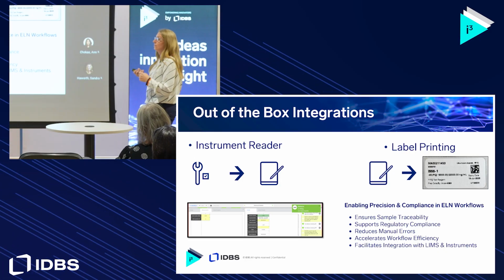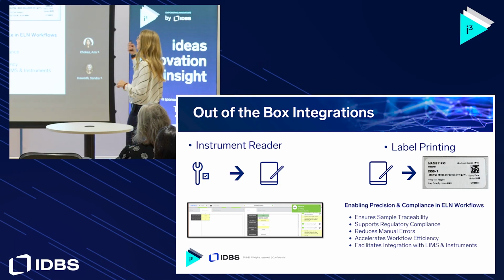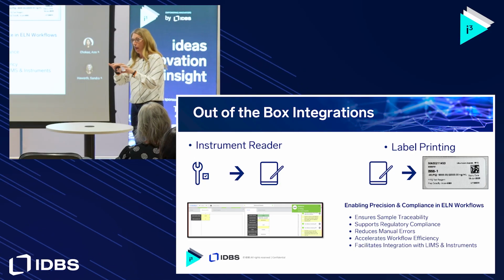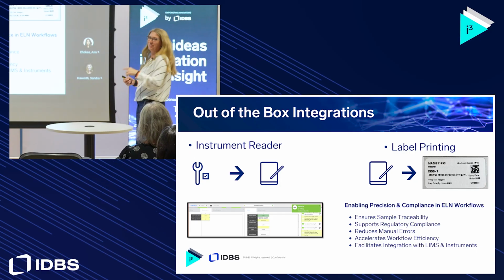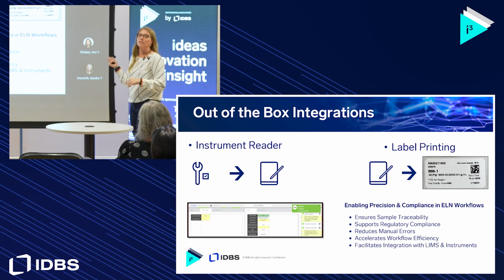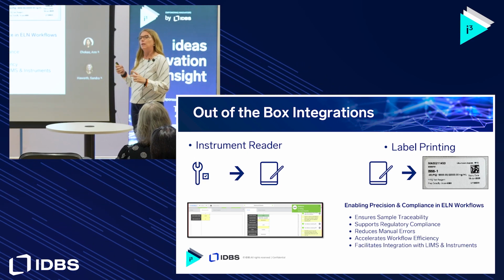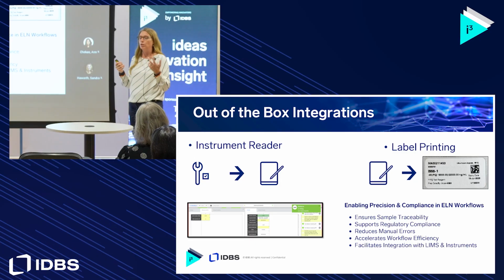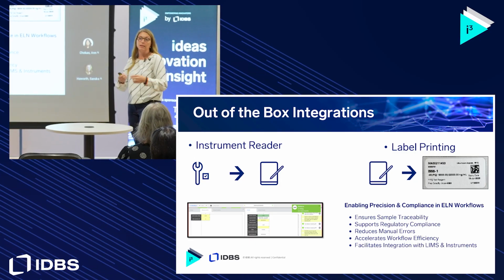Label printing, we don't want anyone to type anything, right? No typing values from a balance, and no typing in your MA number, your EQ number, because you always forget 10 at least. So I don't know if you've done that, but we actually have site-specific labels. Now that doesn't necessarily seem the best. However, we have found that some sites want a little bit more information, and some sites are okay with the out-of-the-box label that we give.